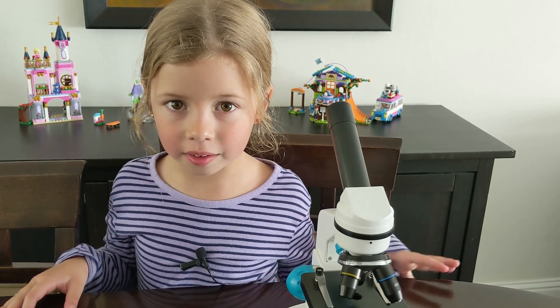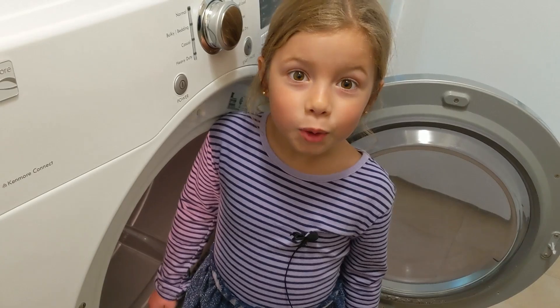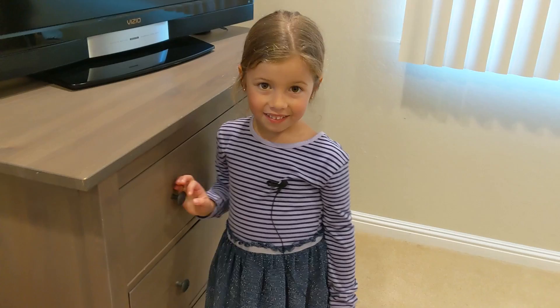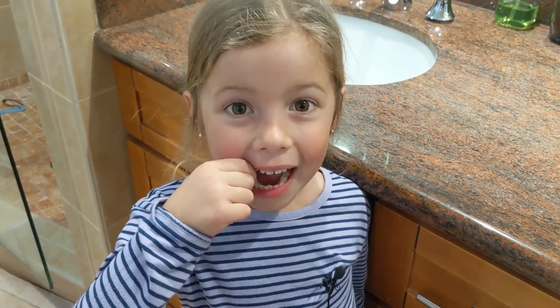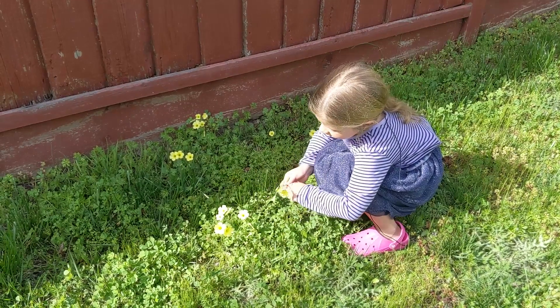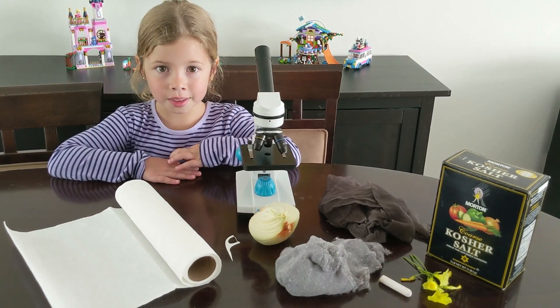First, I need to gather my specimens. We'll start with some chalk, a paper towel, and some salt, some dryer lint, some of Mommy's pantyhose, tooth plaque, some flower petals, and an onion. Now that I've got my specimens, it's time to check them out.